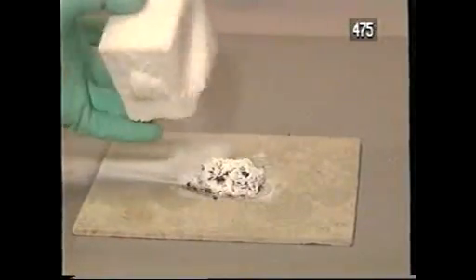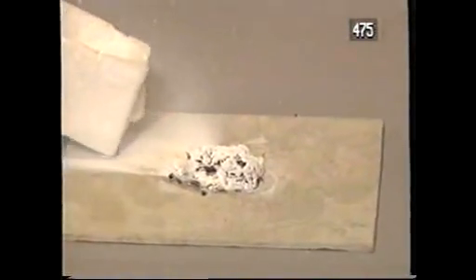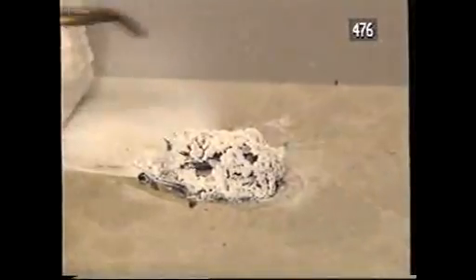When I remove the block after the reaction, there's a mixture of white material, which is magnesium oxide, and black particles of carbon, which have come out of the carbon dioxide. Magnesium is very unusual in burning in carbon dioxide. Most things don't. What's more, carbon dioxide is very dense and it doesn't burn itself, so it hugs the ground and puts fires out. Here's a demonstration.